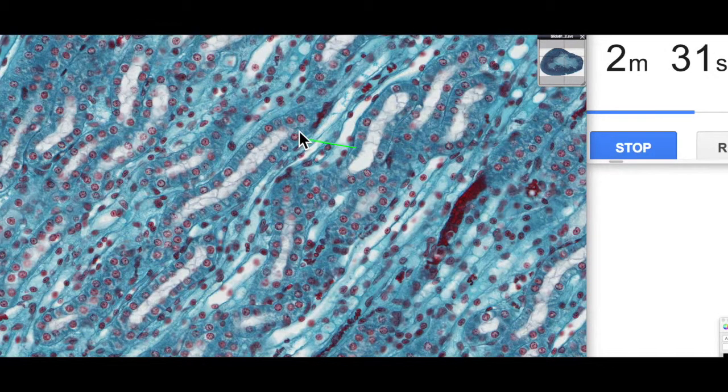So this is a simple cuboidal epithelial lining. You can see all the nuclei in a row here. Typical of a cuboidal cell is a nice round nucleus, as you can see there.